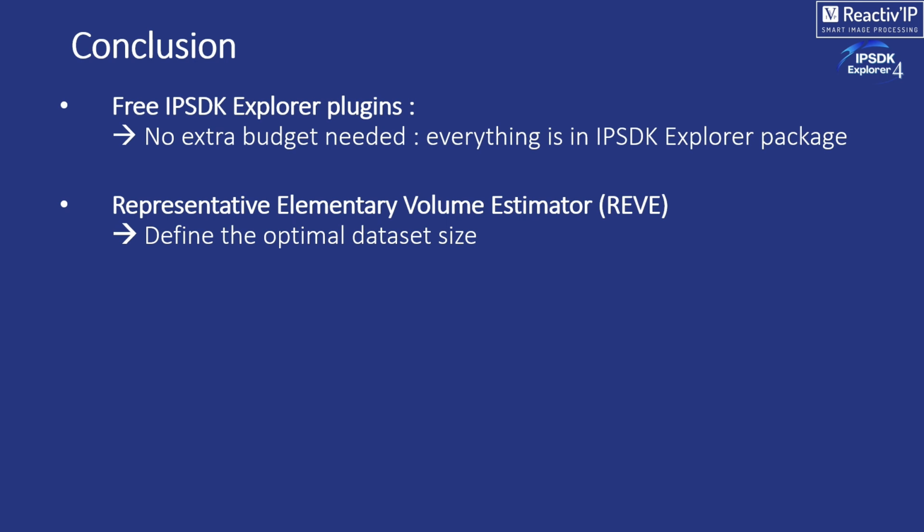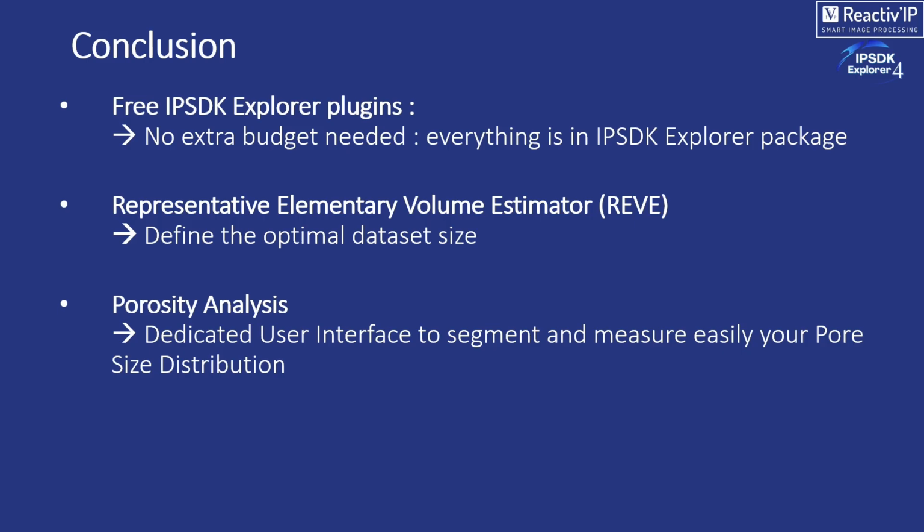This will really permit you to minimize the time of computation and not needing to have the best workstation in the world to be able to make the computation. Porosity analysis, if you have individual porosities, isolated porosities, this is a plugin that is used for. So you can segment, you can measure, you can understand your pore size distribution.